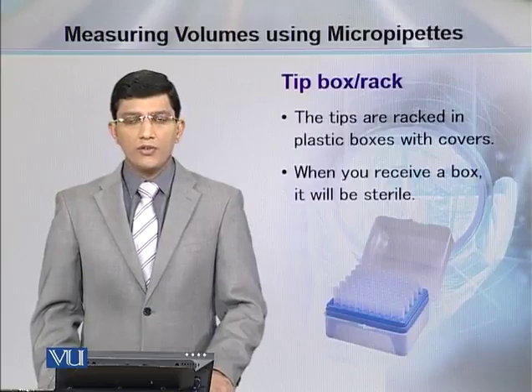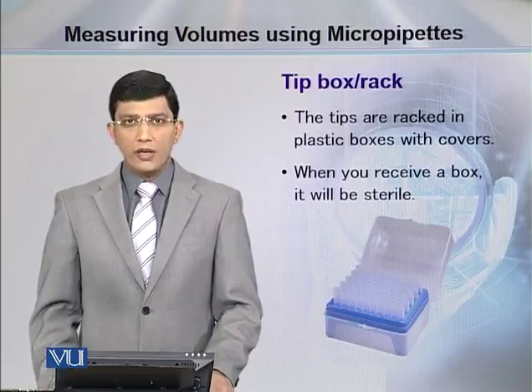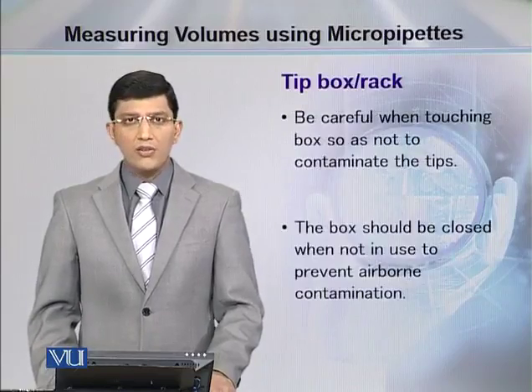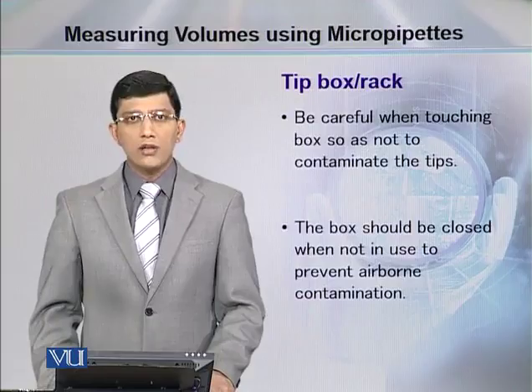So when these boxes are not in use, do cover them, otherwise there will be some airborne contaminations and it is going to ruin your experiments.